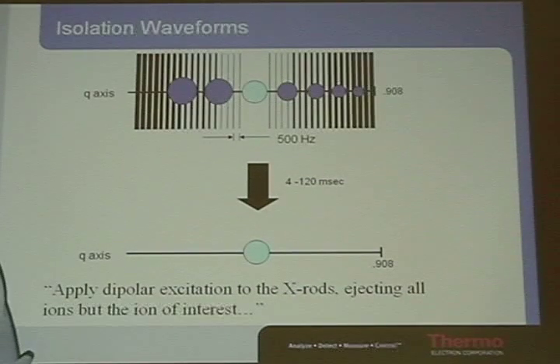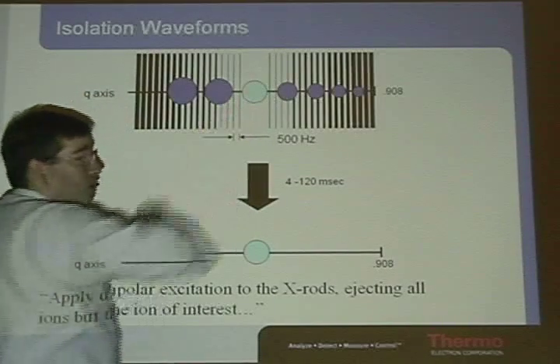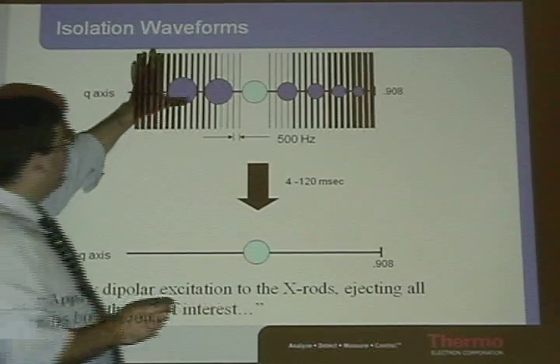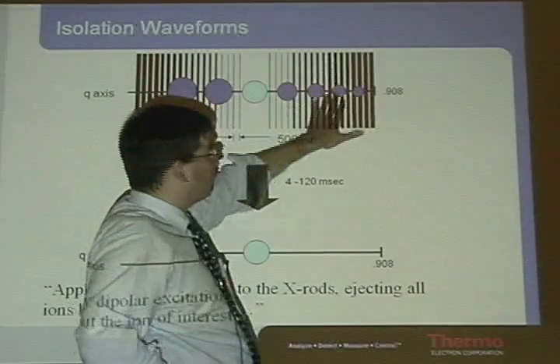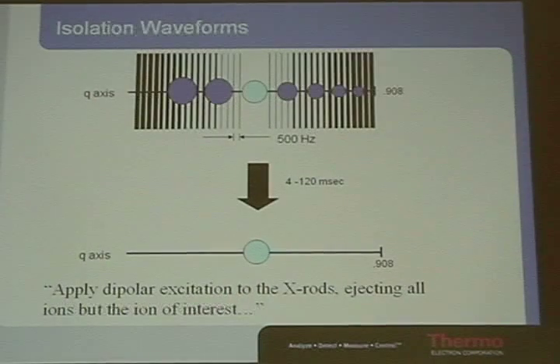So that's how you can do the pseudo MS3. When you set the isolation width, you're setting how many frequencies you get rid of. How does it do pseudo MS3? That requires the phosphate to drop off. With the pseudo MS3, they calculate where the phosphate would be and remove those frequencies too. To produce that ion, you need to fragment. So the precursor fragments, and those frequencies aren't being used; they're there, but there's no ion to hear them. The minute it fragments and produces the ion, those ions hear the frequency and they fragment again.